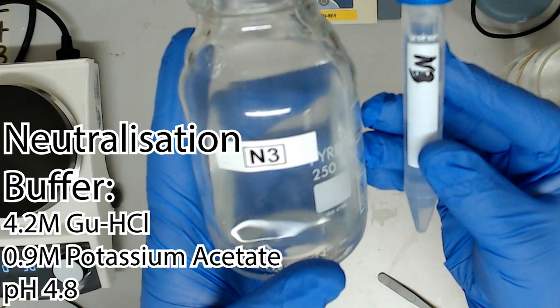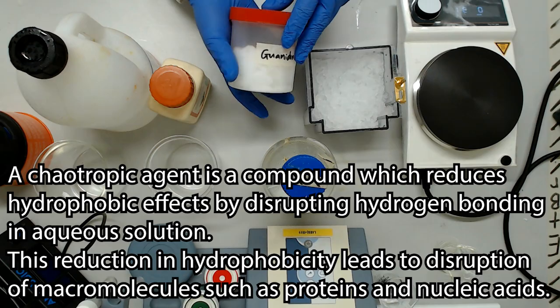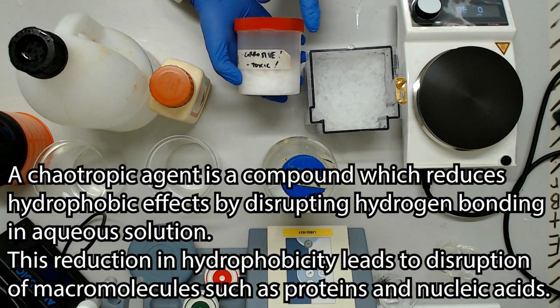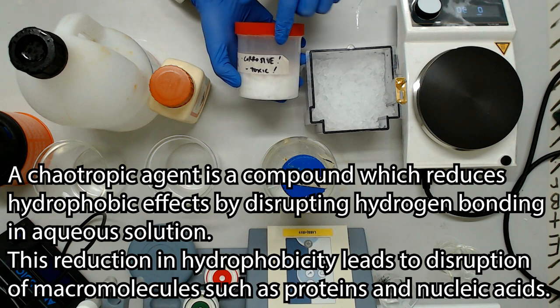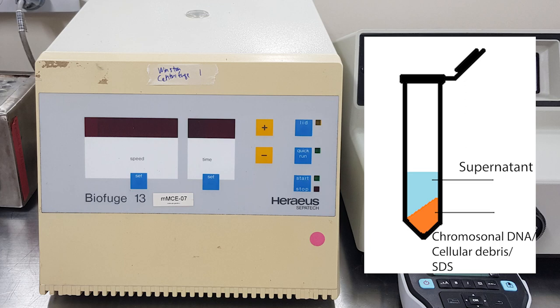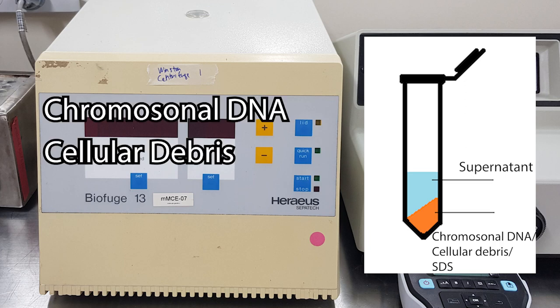Your third mini prep buffer is the neutralization buffer, which uses a powerful chaotropic salt to precipitate out all the things we don't want, while keeping our plasmid DNA and other small DNA molecules in solution. This is considered the major separation step, as we'll be removing chromosomal DNA, cellular debris and SDS from the solution.